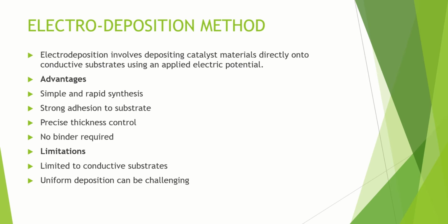The advantages include it's fast, you get strong adhesion to the substrate, and you have precise control over the thickness, plus no binder is needed here. The limitations include it only works on conductive substrates, and getting a perfect uniform coating can be tricky.